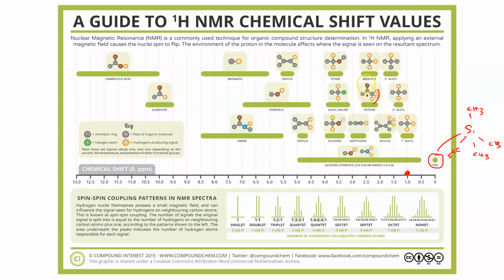So this presence of the oxygen can change where we see the peaks, remembering that the peaks are not going to be in an exact spot every time. The way the molecule is connected together influences the chemical shift, but it can be very powerful for us to be able to figure out where groups in a molecule are attached.